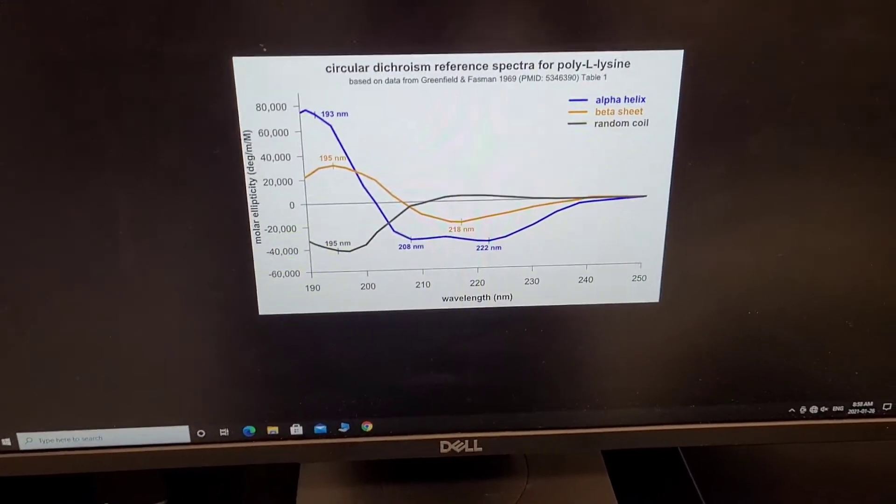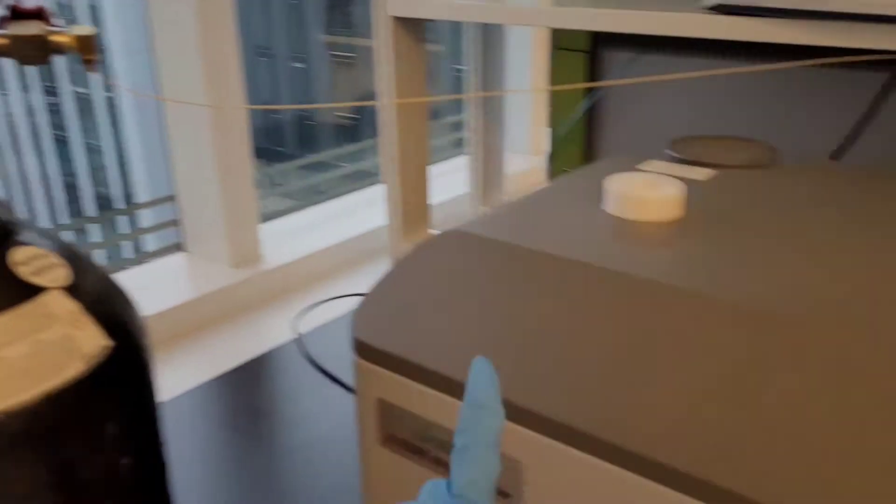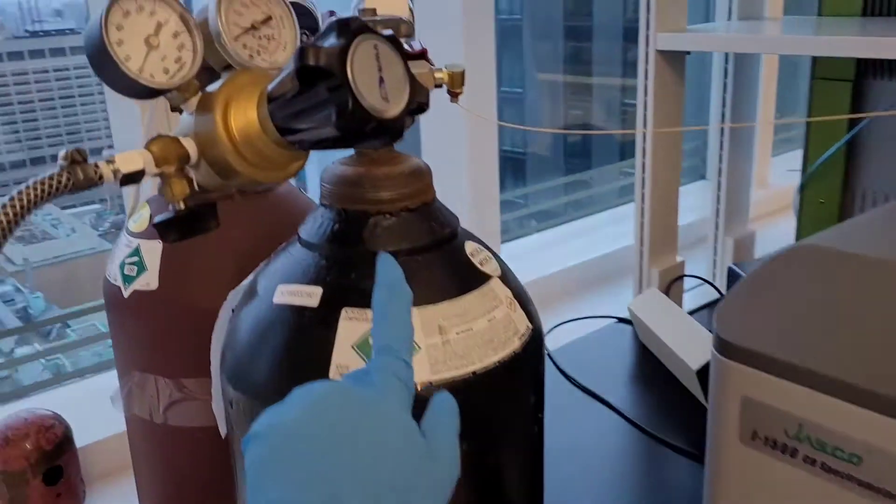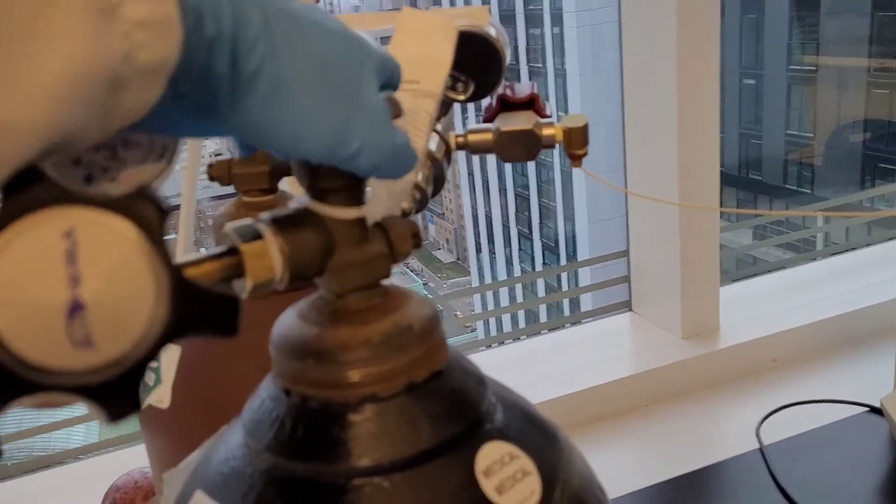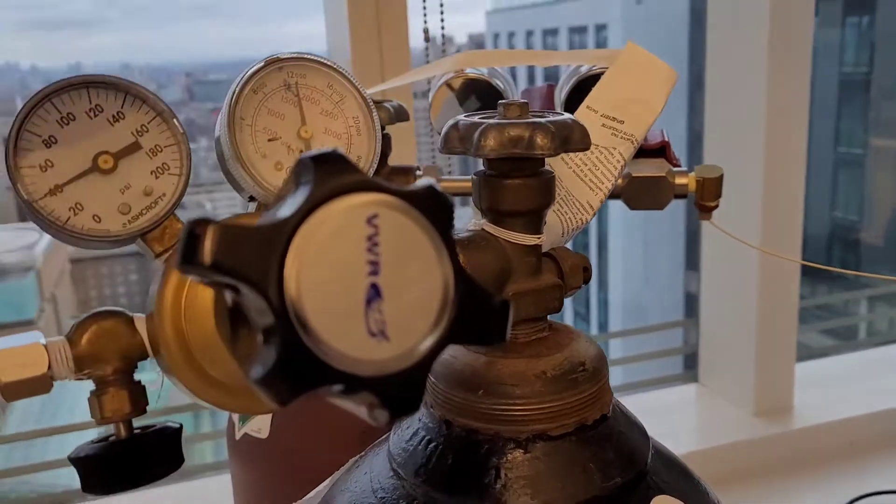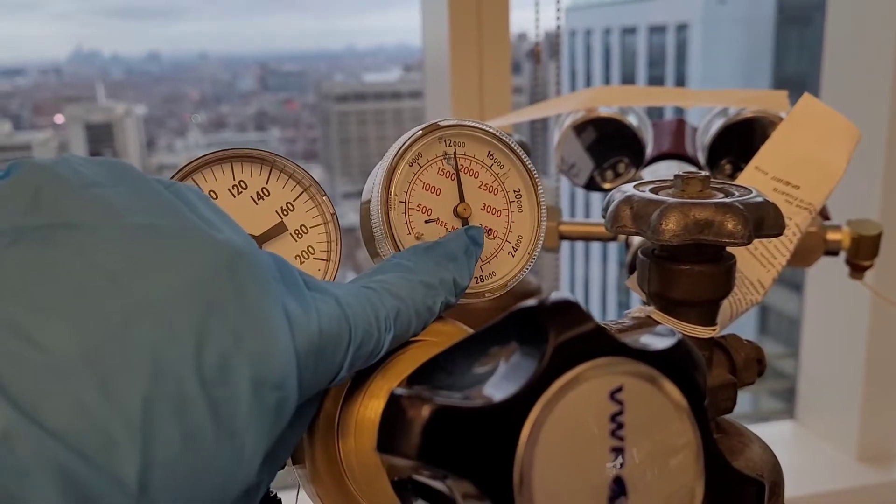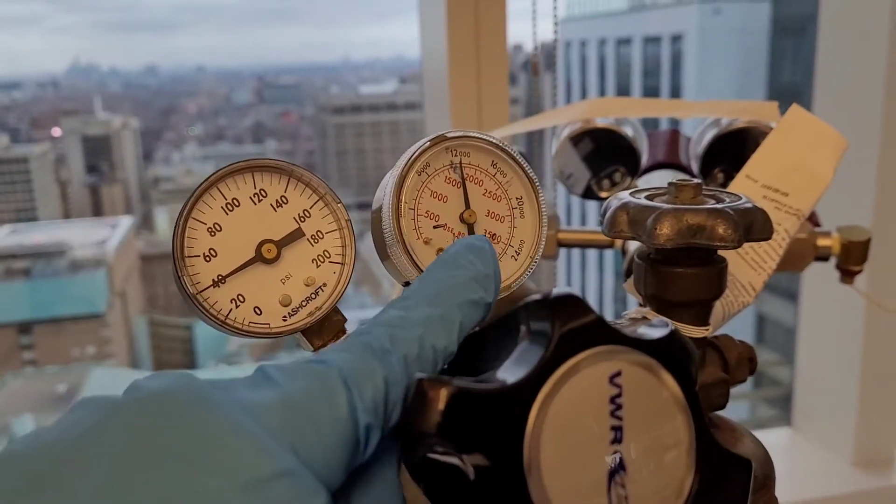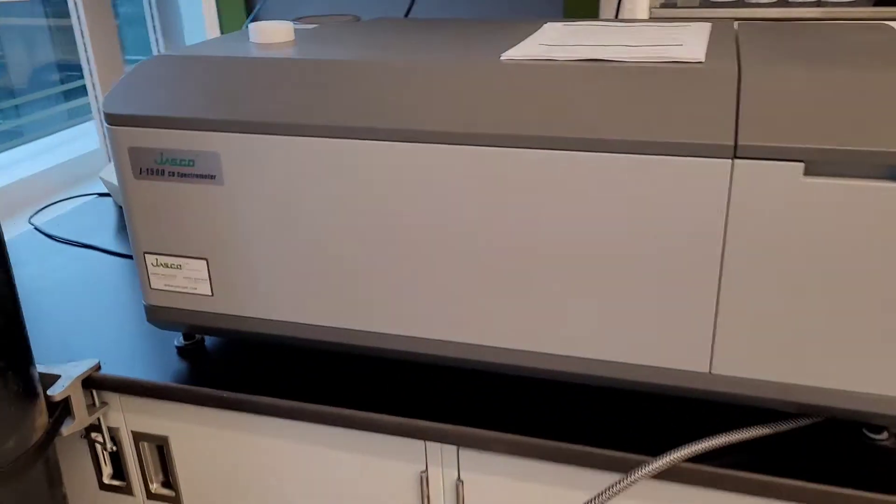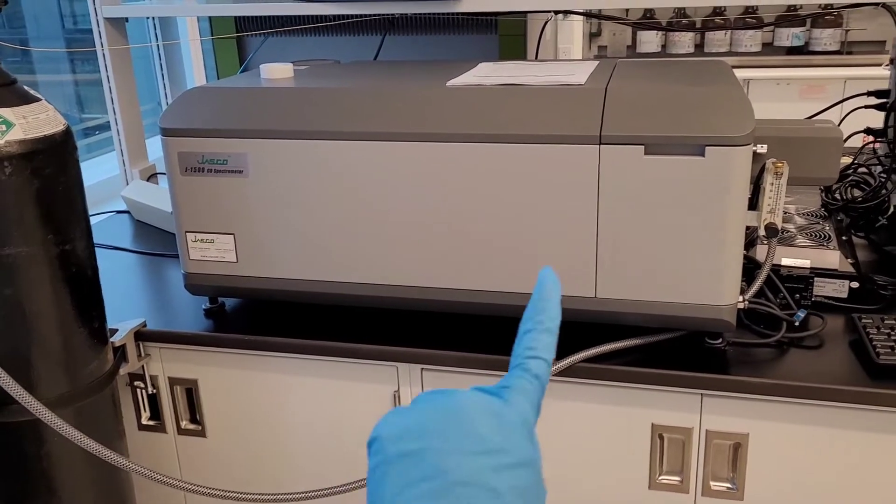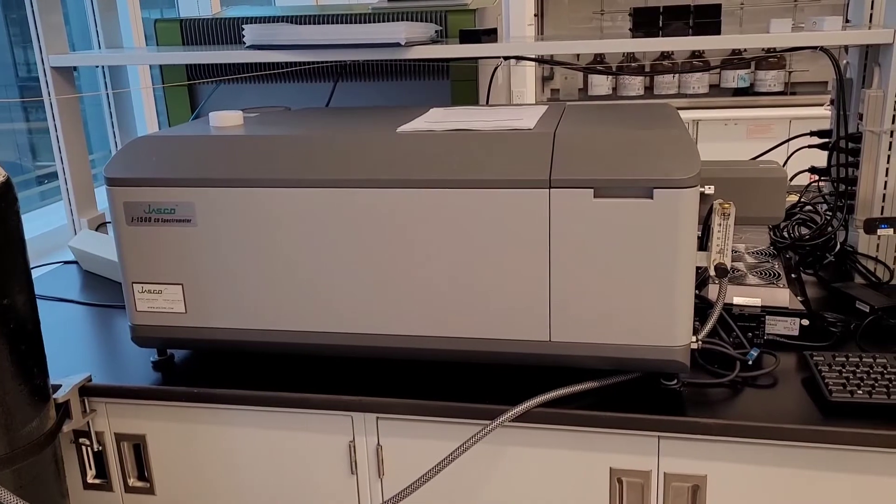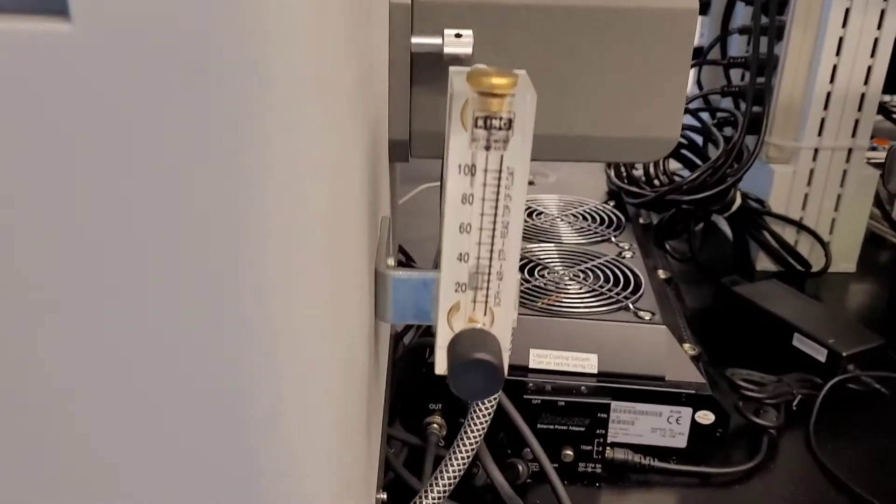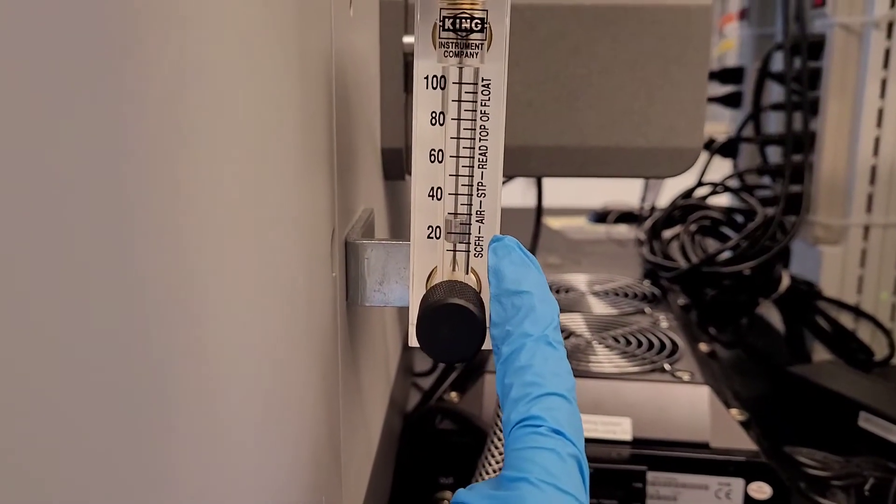First thing that you have to do is to supply the instrument with nitrogen gas. So we first open this and always make sure there is enough nitrogen gas. It would be pretty bad for the light source if you run out of nitrogen. Make sure this is about 20-ish.